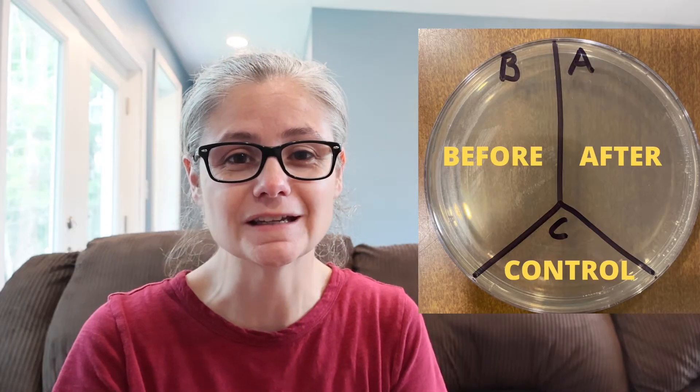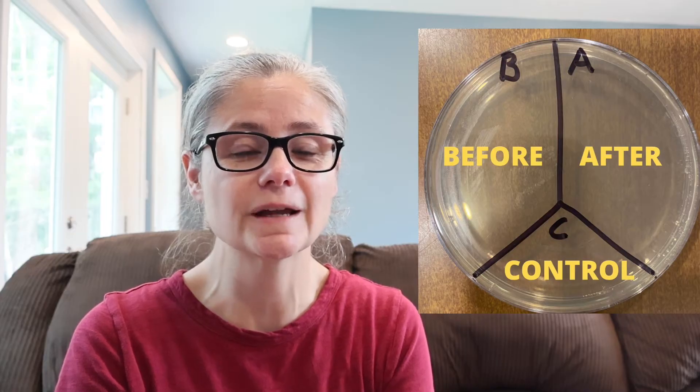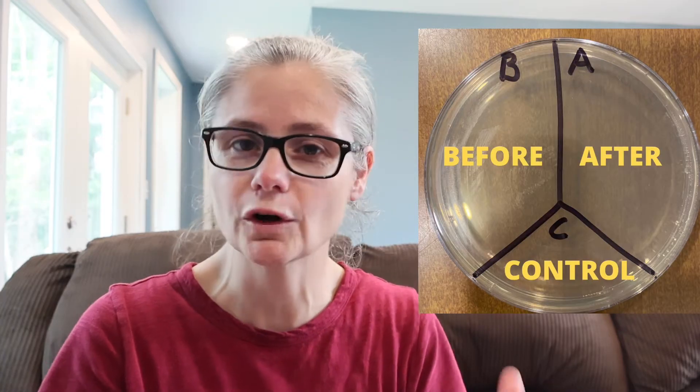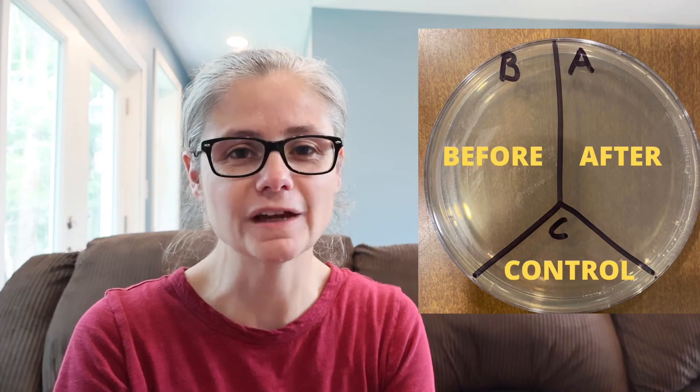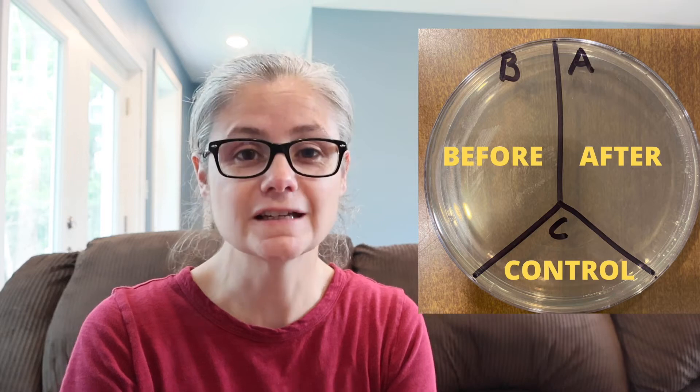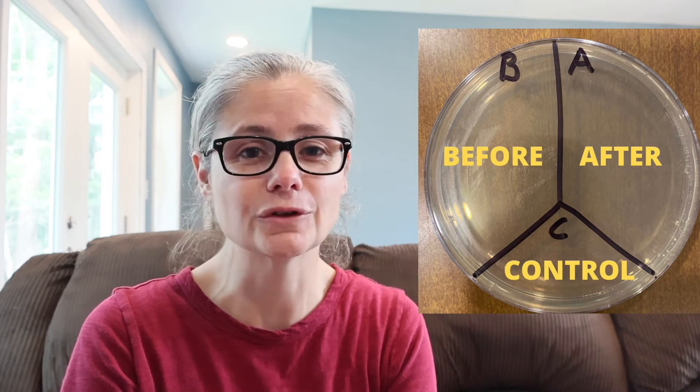In order to test how well the e-cloth mop removes bacteria from my home, I'm going to take a petri dish and label it A, B, and C. I'll take some sterile swabs and swab my floor, placing that sample in section B for before. Then I'll clean my floor according to the e-cloth mop directions. I'll swab the area again and place that sample in section A for after. C is my control — nothing's going to go there.